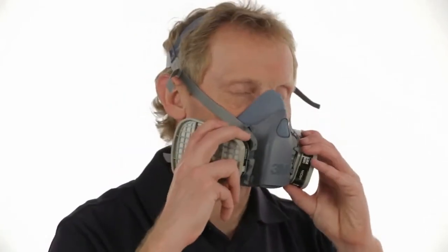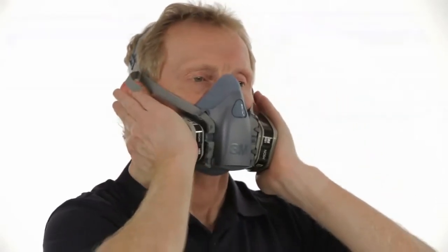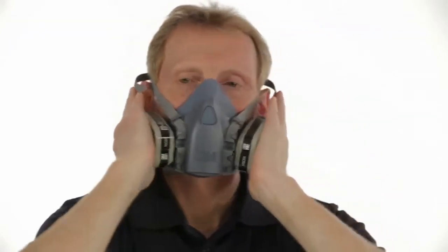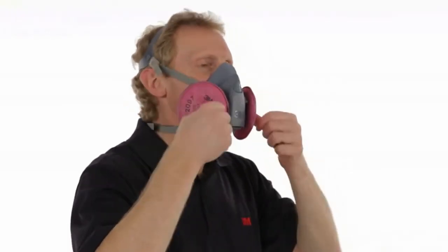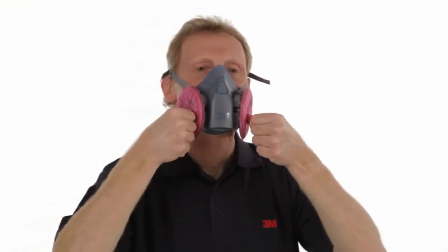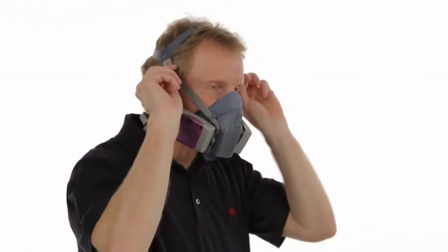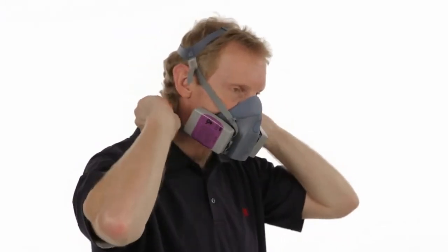To perform a negative pressure user seal check with cartridges, first cover the open area of the cartridge with the palms of your hands. Filter retainers may aid in conducting a negative pressure user seal check. To perform a negative pressure user seal check with the round 2000 or 2200 series particulate filters, position your thumbs over the center of the filters to restrict airflow through the filter. To perform a negative pressure user seal check with the rectangular 7000 series particulate filters, squeeze to compress the filter.